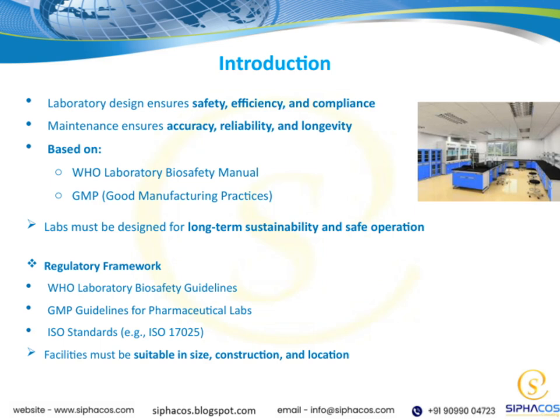These principles are grounded in key guidelines like the WHO Laboratory Biosafety Manual and Good Manufacturing Practices, or GMP. It's crucial that labs are designed not just for today, but with long-term sustainability and safe operation in mind. This means considering how the space will function over years to come.